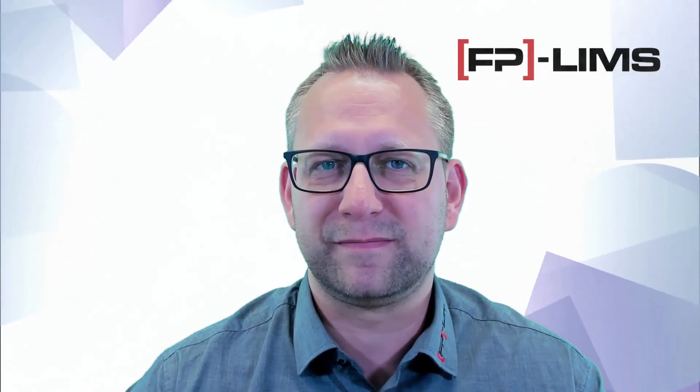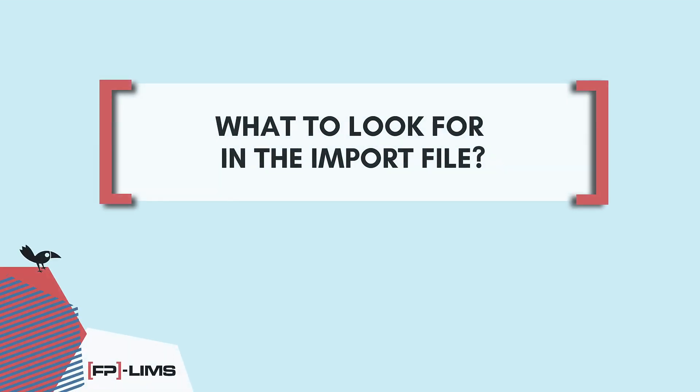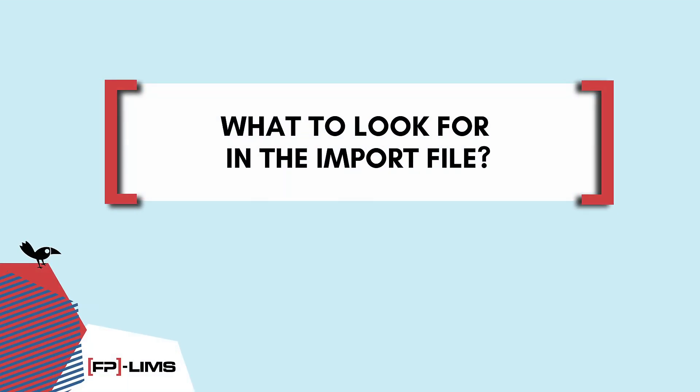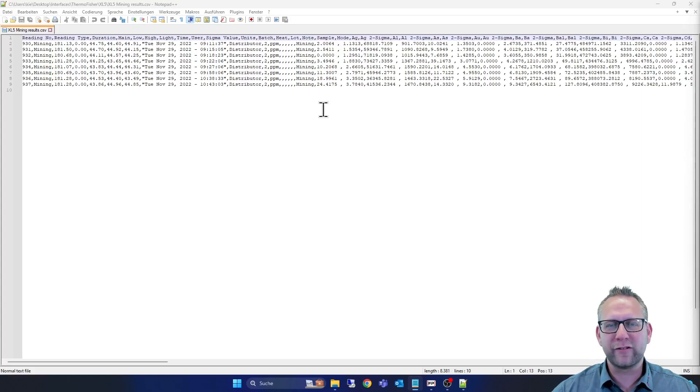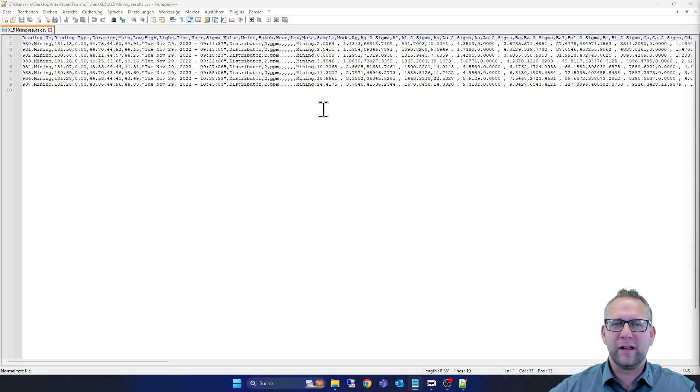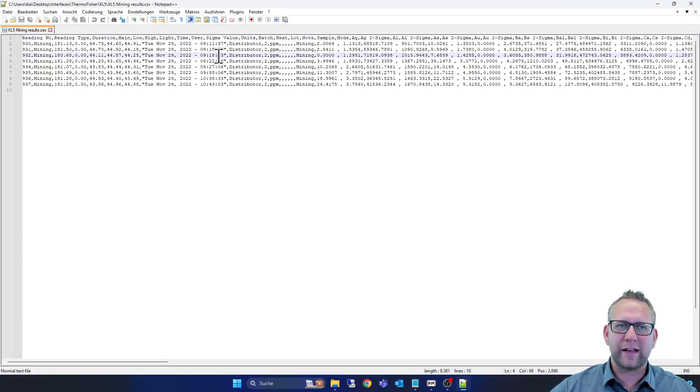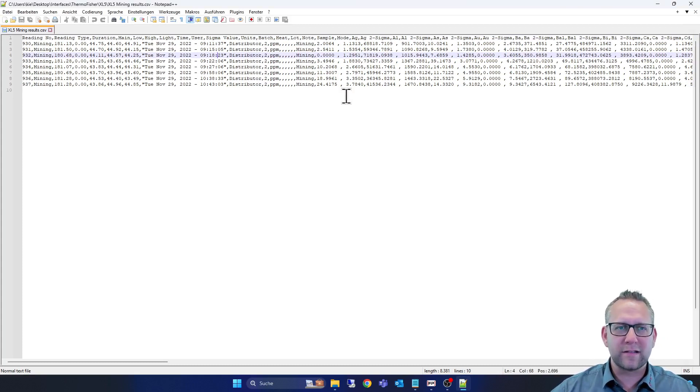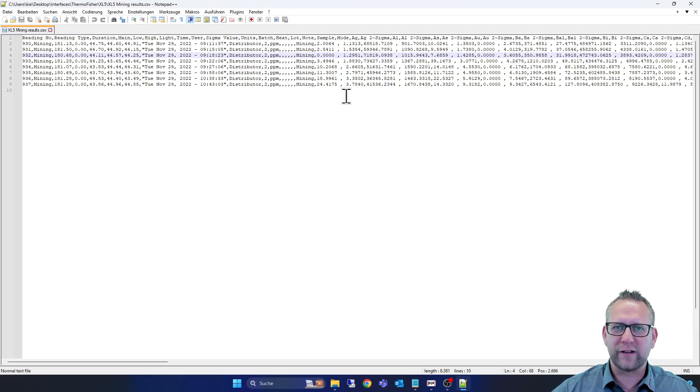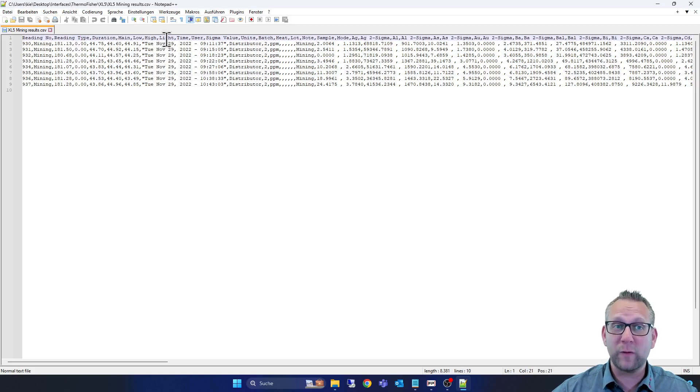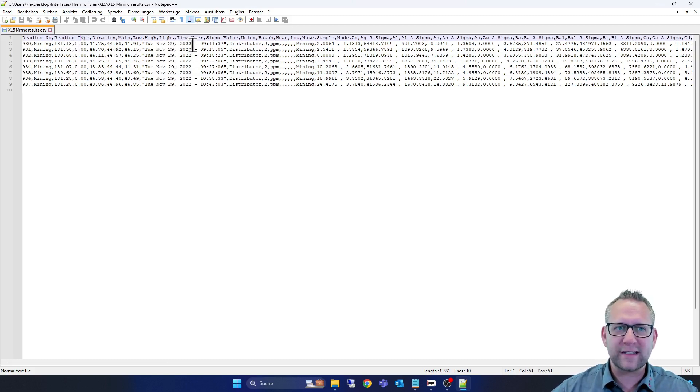So now we are in the file. This is a CSV file, XL5, and first of all I take a look at the type. This is a UTF-8 file, and this is important for the configuration into FP-LIMS. Then I take a look at the identification fields, the separator between them.